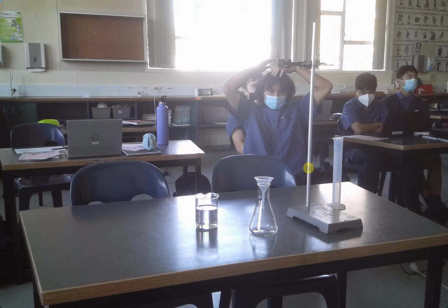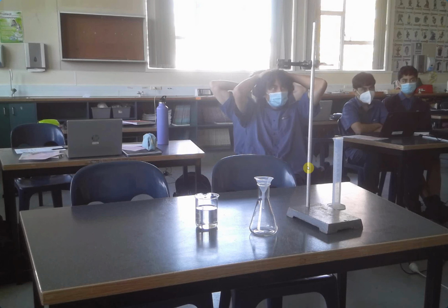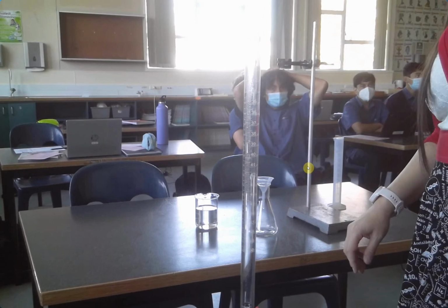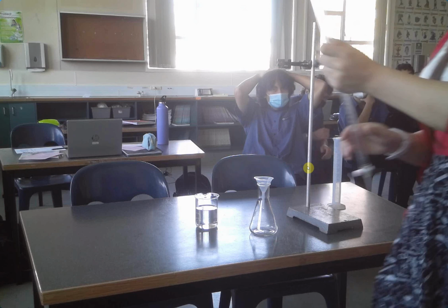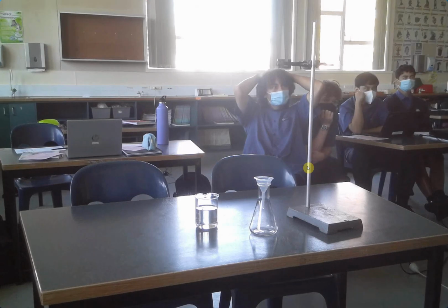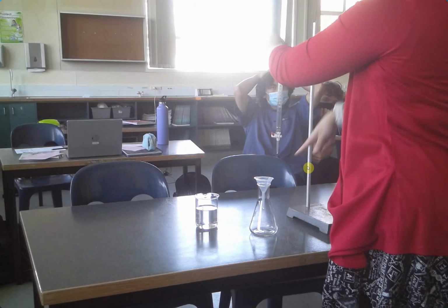The burette is luckily plastic, so I'm not so worried about you guys breaking it, but the last ones are terrifying. What you'll notice on it is that it has little measurements, just like a measuring cylinder. But the thing that's different is that the bottom is 50 and the top is 0, whereas with a measuring cylinder, the top is 100 and the bottom is 0. It's different because the liquid's coming out the bottom here.